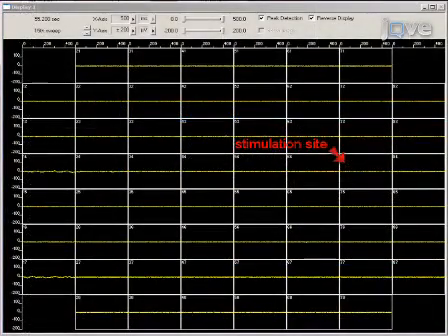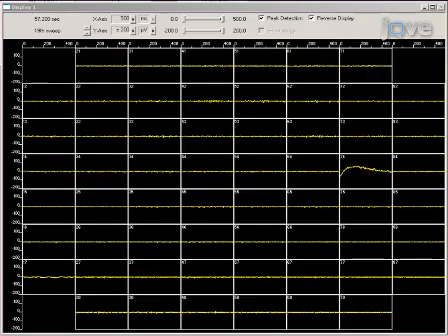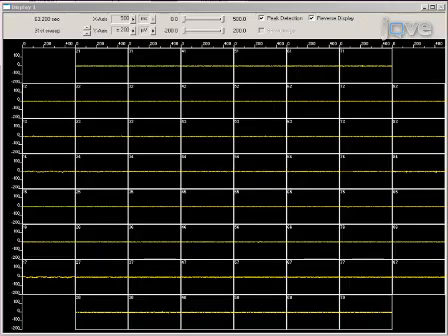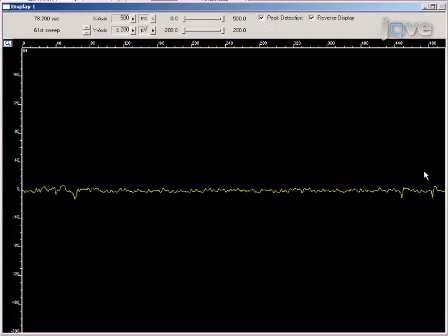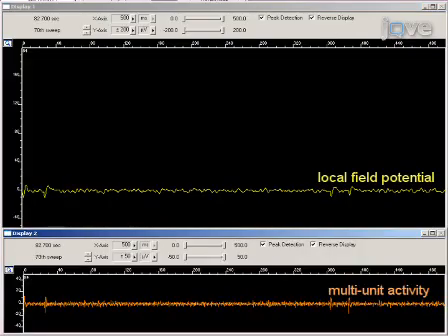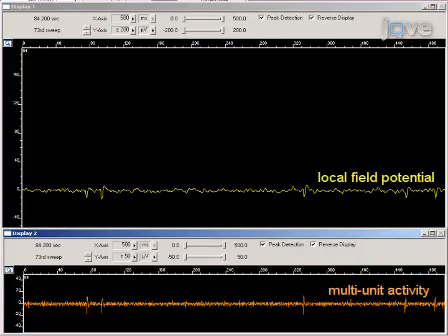Typical stimulus-evoked LFP responses appear similar to spontaneous activity bursts. Blanking circuitry disconnects the amplifiers during stimulation to reduce stimulus artifacts and to prevent amplifier saturation. The stimulation electrode requires several seconds to recover from stimulation and thus cannot be used to record response.